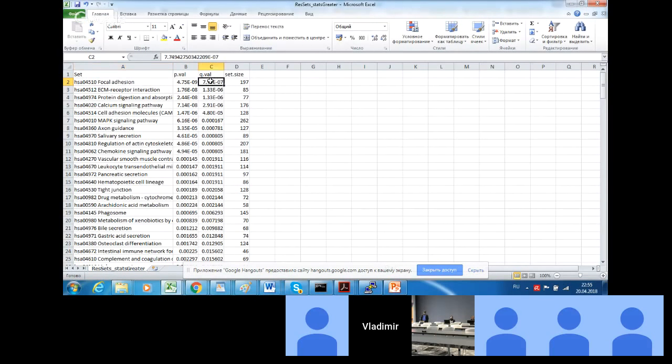And the main value we have here, similarly to the adjusted p-value we saw in DAVID's case, is theoretically or statistically the same: an adjusted p-value, here called the q-value, for each pathway.